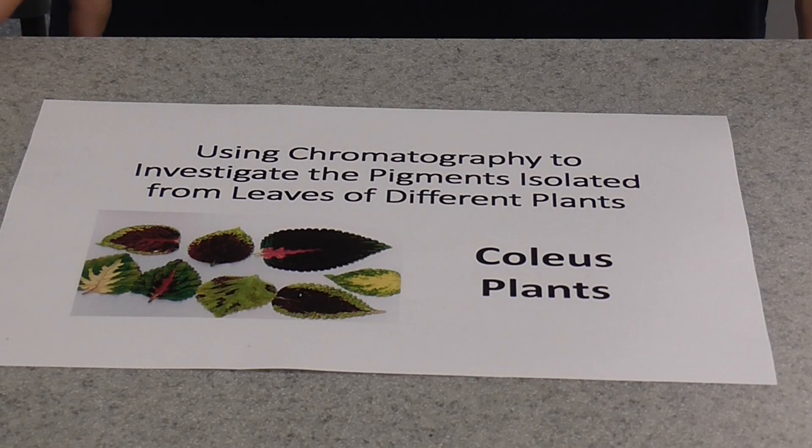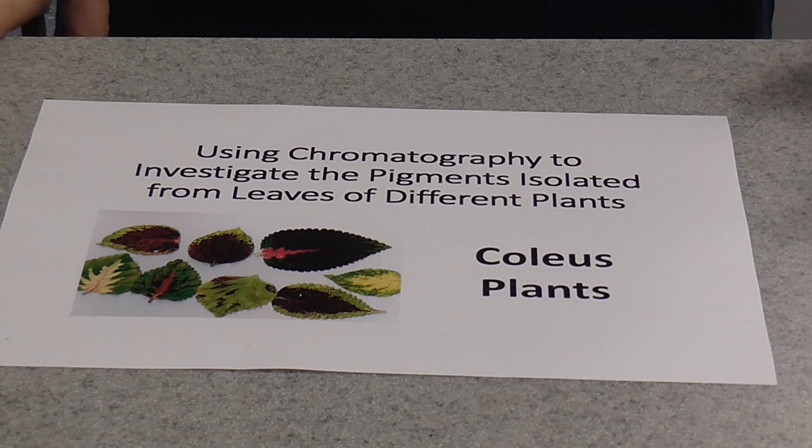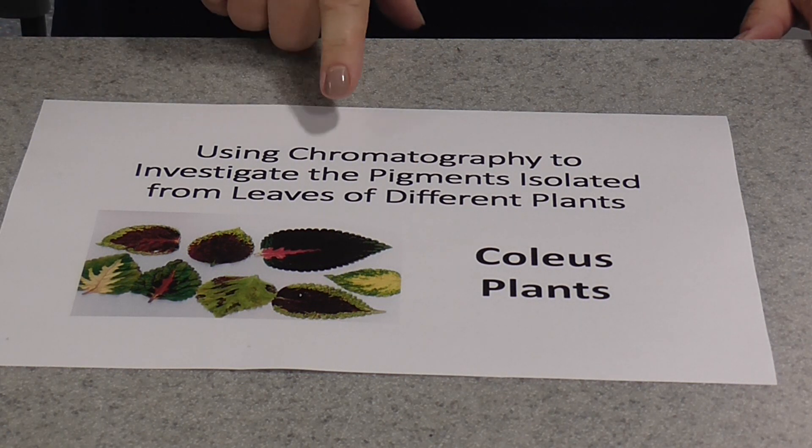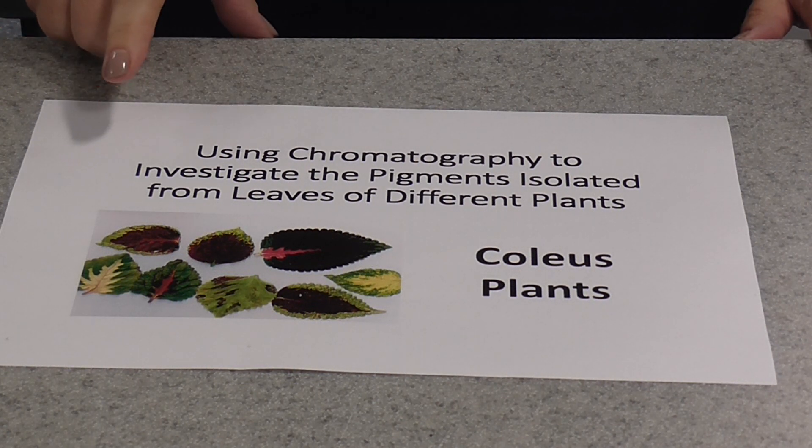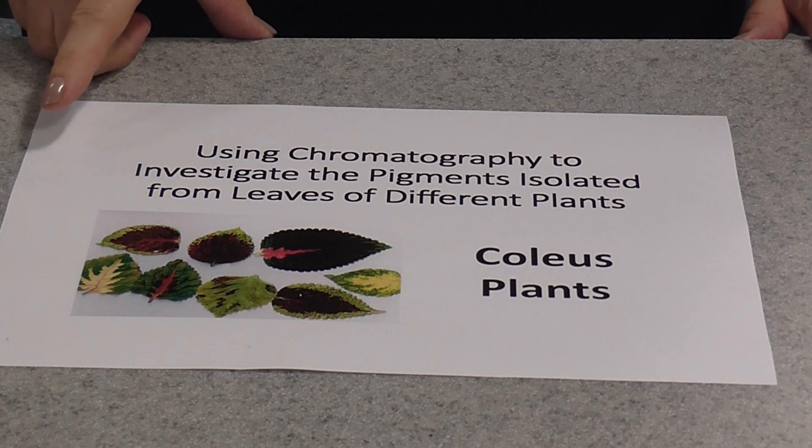I'm going to show you how to do one of the A-level biology practicals. This is required for A-level but not for AS-level. It's using chromatography to investigate the pigments isolated from leaves of different plants.